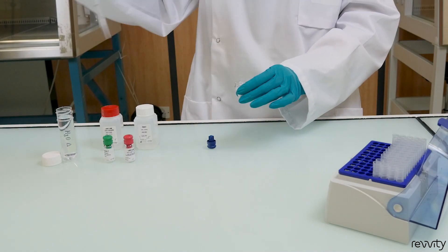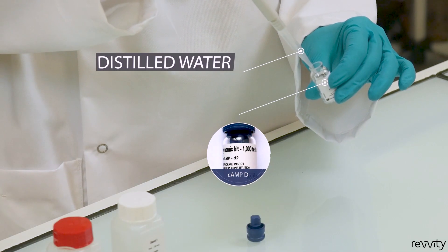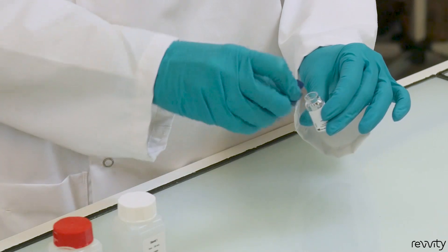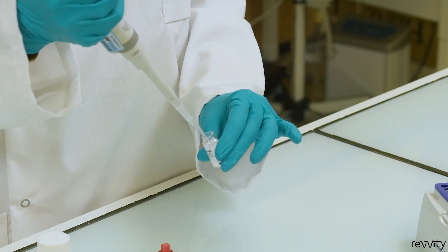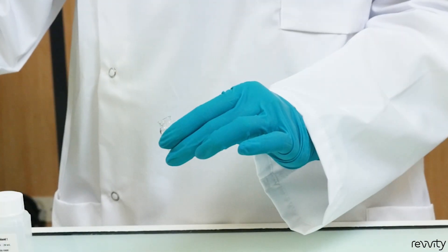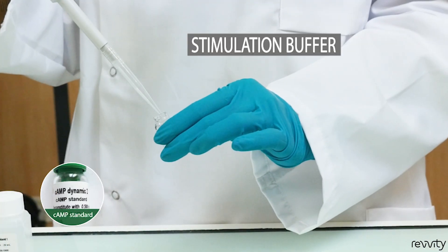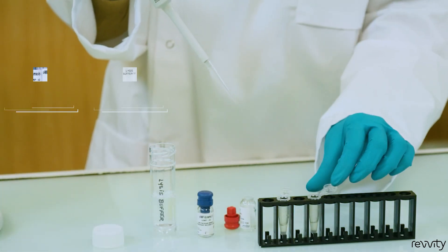Let's start now. First, prepare a stock solution by reconstituting the cyclic AMP antibody and labeled cyclic AMP in distilled water. Then, reconstitute your standard using stimulation buffer. You now have 5X stock solutions that can be aliquoted and frozen for future use.